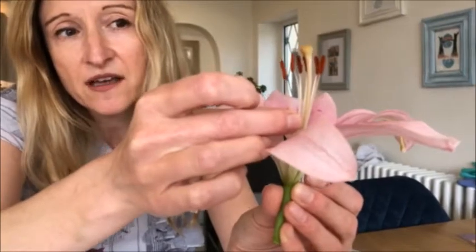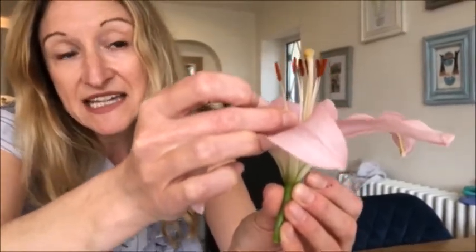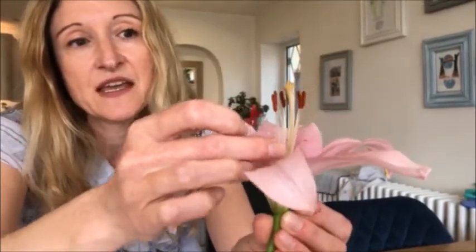Now pollen is the male reproductive gametes, so sex cells in the plant. So the orange, and you can actually see this on my hands, are the pollen grains. Okay. Now the pollen grains are made by this male reproductive structure here, and this is called the anther.